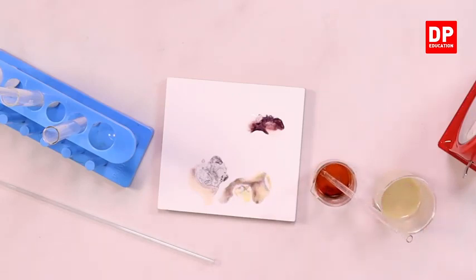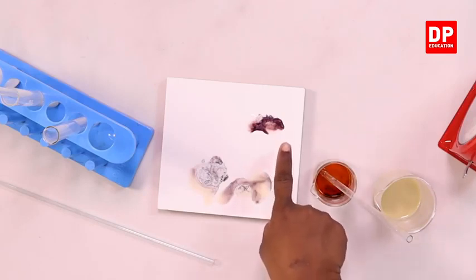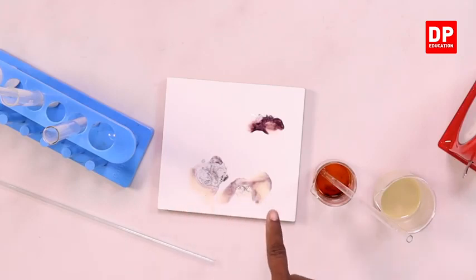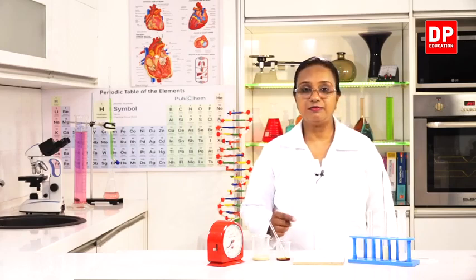Here also you can see the formation of the dark blue color, but when you compare the 3 samples, the first one, pure starch, is very dark, after 2 minutes is a little lighter, and after 4 minutes there is a slight difference. We will have to wait for a long time before we see a distinct difference.